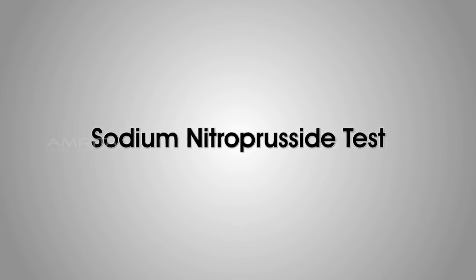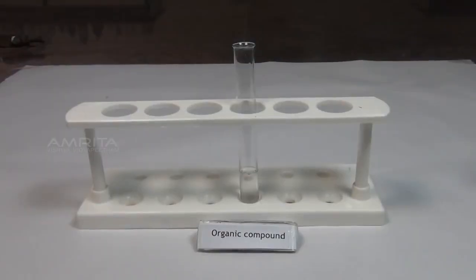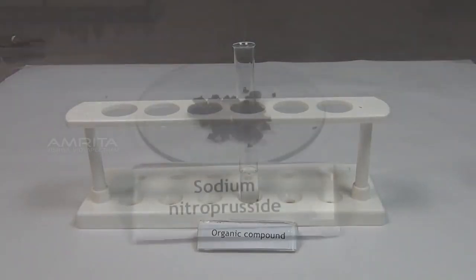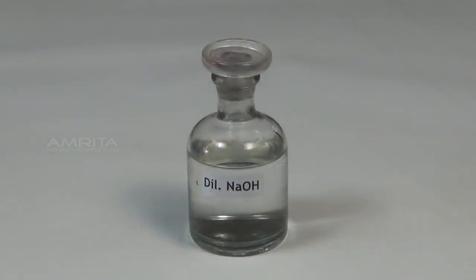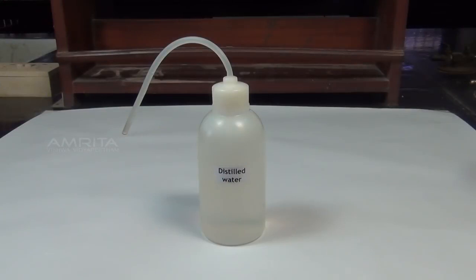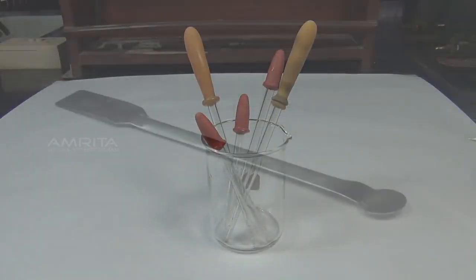Sodium nitroprusside test. Materials required: organic compound, sodium nitroprusside crystals, dilute sodium hydroxide, distilled water, test tube, dropper and spatula.